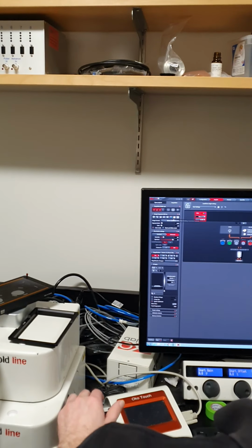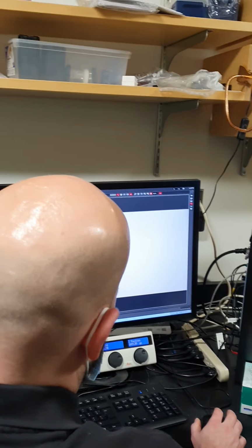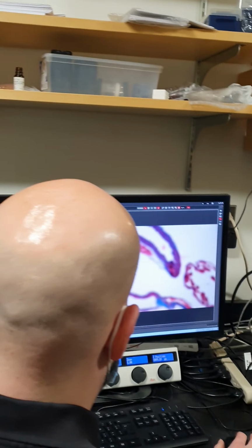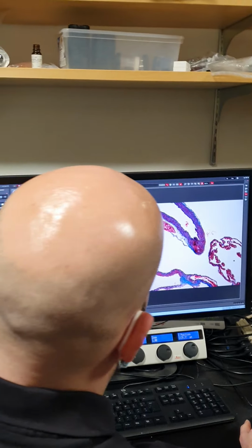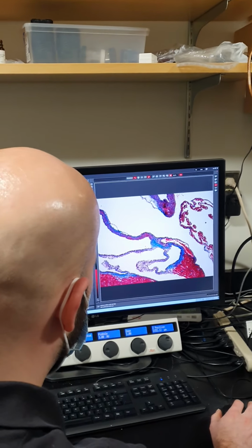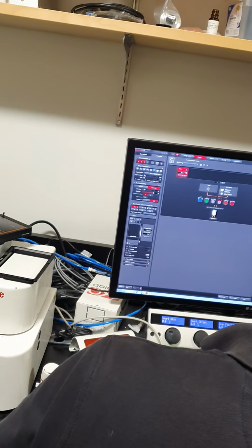And that's just to make sure our colors are accurate. If you're doing something where it's not sensitive to colors being perfect, then you could skip that. But is this process required for all types of imaging, or just for bright field imaging? Okay. And especially for quantification purposes.